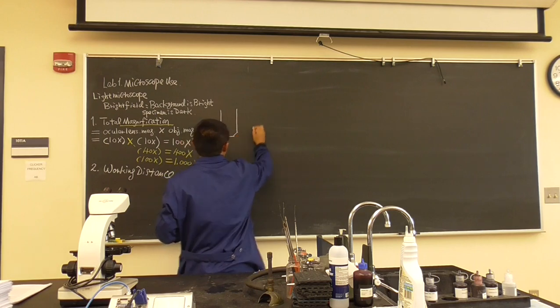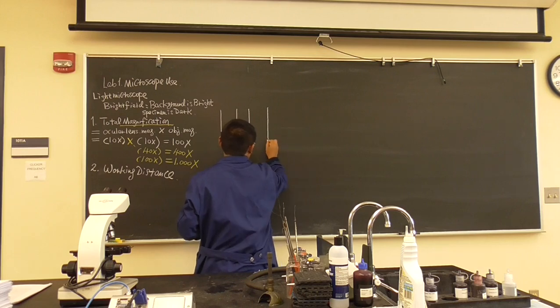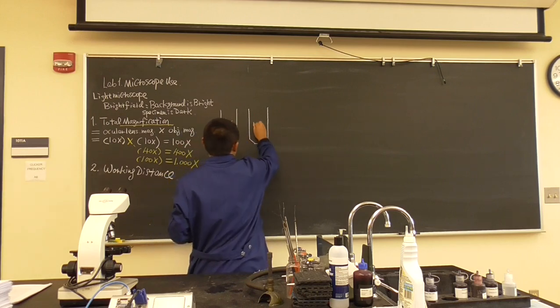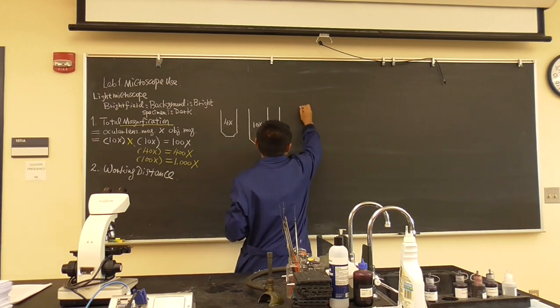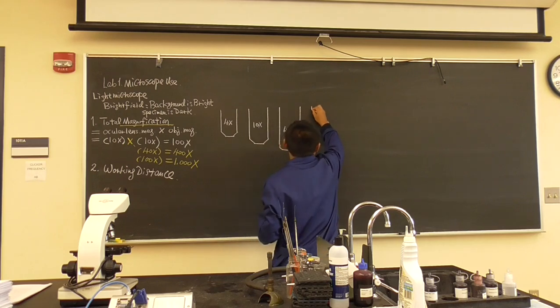The ones we use in the lab are 4x, 10x, 40x and 100x.